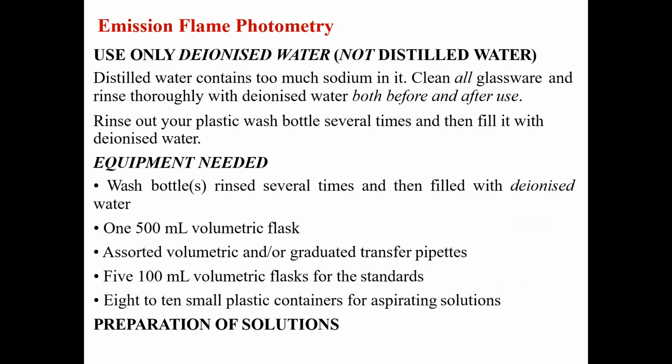In emission flame photometry, we use only deionized water here, not distilled water, because distilled water contains too much sodium. So clean all glassware and rinse thoroughly with deionized water before and after use. Rinse out the plastic wash bottle several times and then fill it up with deionized water.